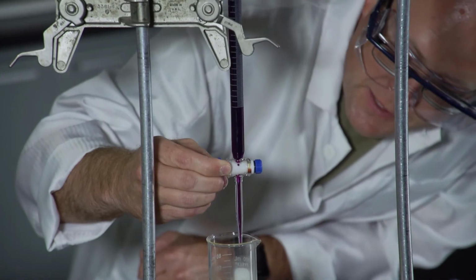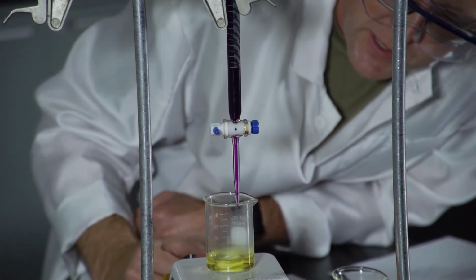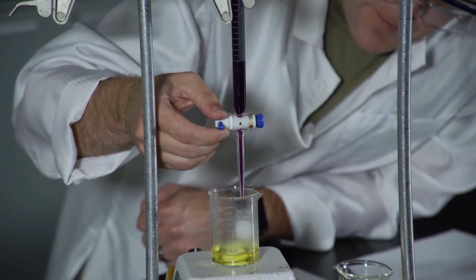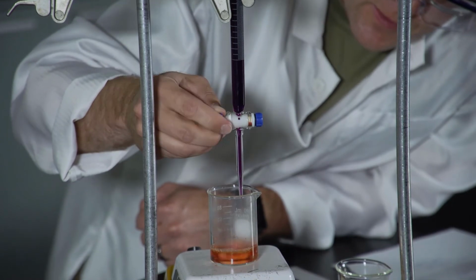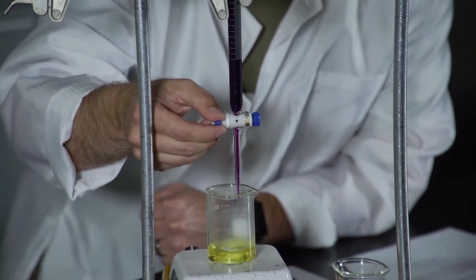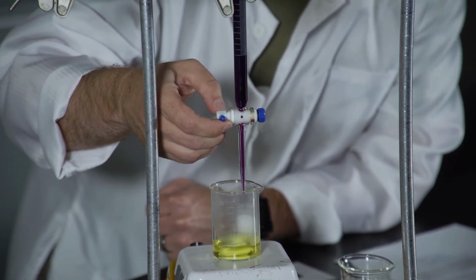So when you add some, you'll notice it turns the solution a little bit brownish as the two colors mix, but then it goes away. Add some more, brownish, goes away. Some more, goes away. So titration is a technique that requires a lot of patience because you don't know exactly how much you need in order to get to that endpoint.